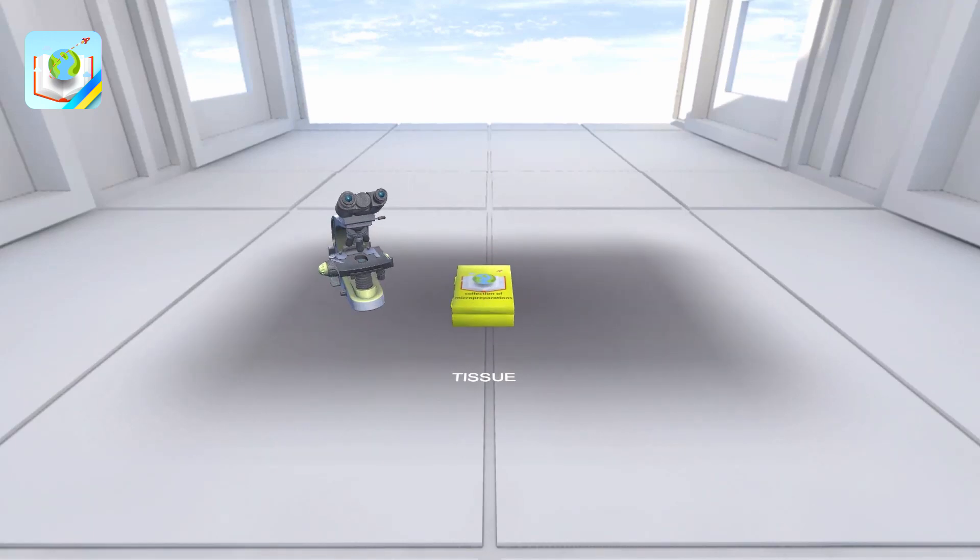Hello, today we will study the tissues of the human organism. For this, I invite you to the histology laboratory. Histology is the science of tissues. Click on the microscope and let's start.